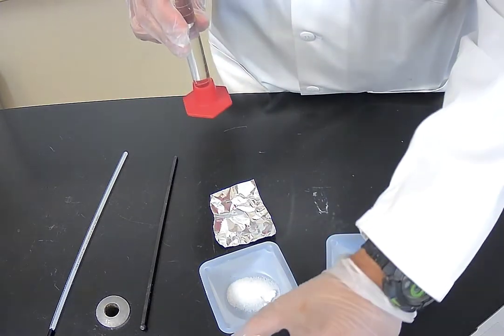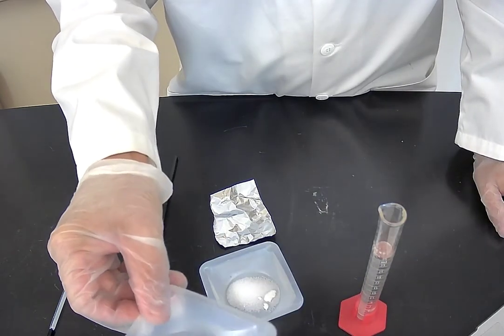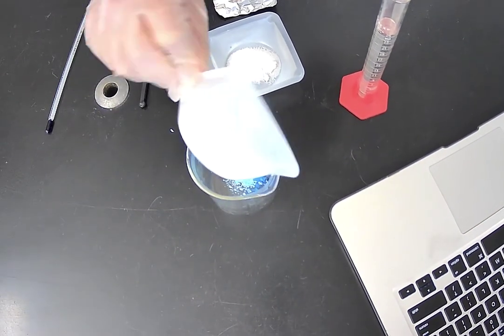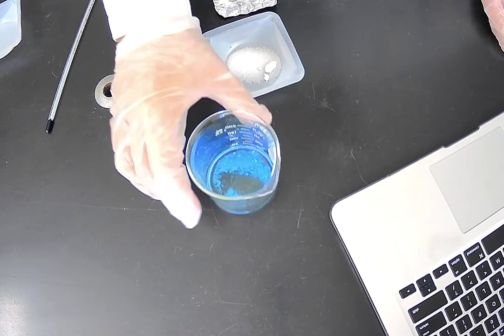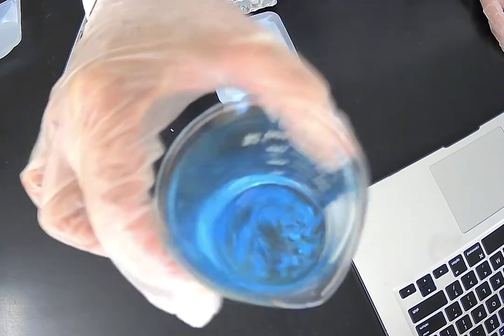Okay. So what we're going to do first is make a solution of copper 2 sulfate. We're going to put the copper 2 sulfate in our beaker, and we're going to add 25 milliliters of water. And we're going to get that copper 2 sulfate in solution. As you can tell, it's not highly soluble, so I'm going to need to agitate these molecules. I'm going to swirl it. This is going to take me a while, but you can see that we are making a bluish solution. So that copper sulfate is getting into solution.